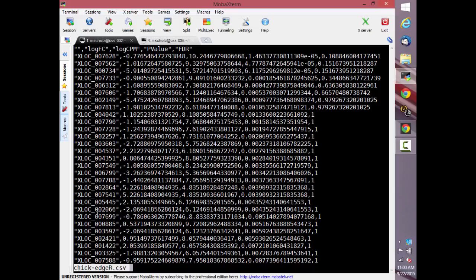So now we have our genes, right? Everything else has an FDR of 1. So the likelihood that that's a real gene is essentially 50% that we actually found it. It's a coin flip for each one of those as to whether or not it's actually differentially expressed. We've got a couple at 0.9, and then here are our 3 genes below 0.2 in this set, right?